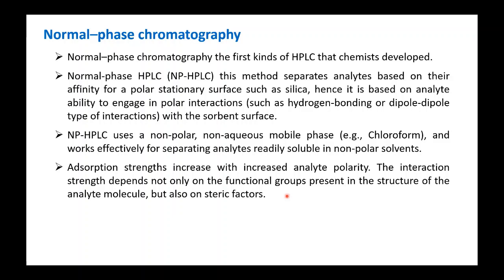The interaction strength depends not only on the functional groups present in the structure of the analyte molecule, but also on steric factors. Particularly the steric factors help in the case of structural isomers: if you have such a mixture, you can do the separation.